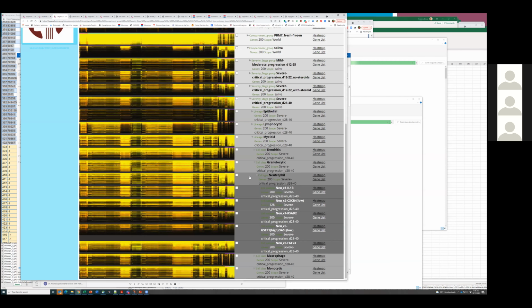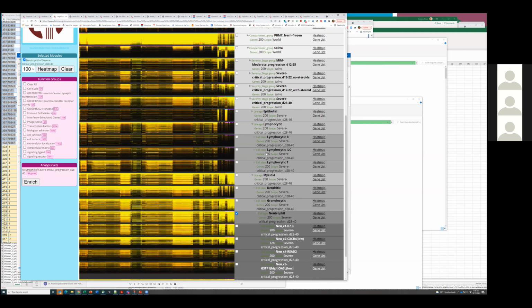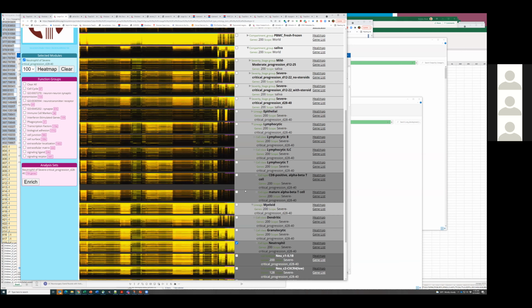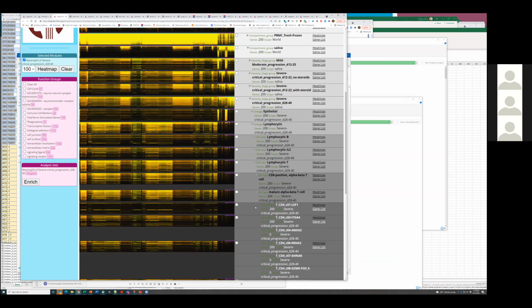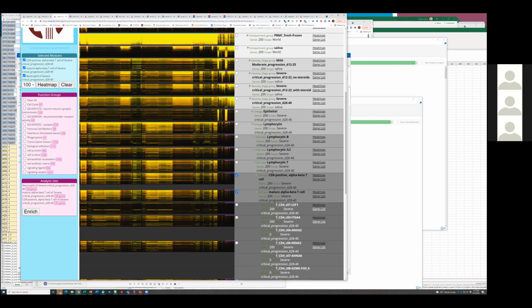And then that gets into this interactomic analysis that King was talking about. So let's say we just do an incredibly simple test of neutrophils to T cells and B cells. And so we can ask maybe two different T cell types, let's say CD4s, CD8s.